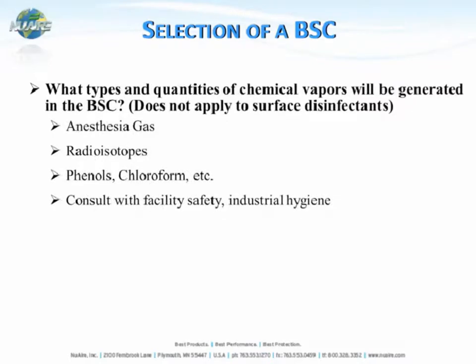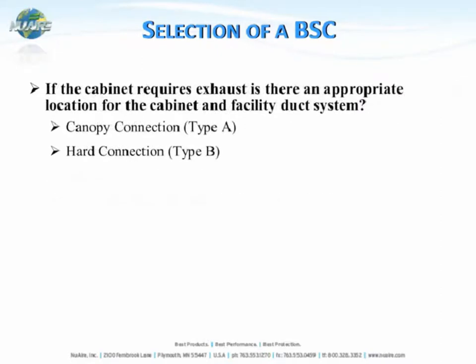The next question is: what types and quantities of chemical vapors will be generated in the BSC? Are you working with anesthesia gas, radioisotopes, phenols, chloroform, et cetera? You'll want to consult your facility EH&S department to find out what they recommend. If your cabinet does require exhaust, is there an appropriate location with access to the facility duct system — whether a canopy-connected Type A1 or A2 cabinet or a hard-connected Type B1 or B2 biological safety cabinet?